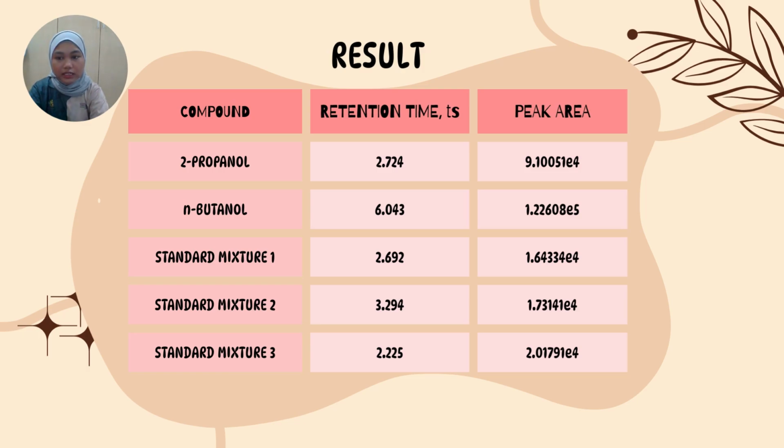More volatile or less polar compounds elute faster. Retention time is unique for each compound under fixed settings like temperature, flow rate, column type, and carrier gas. So consistent conditions are essential for accurate comparison. Lower boiling point compounds elute faster, while polar compounds may elute later if the stationary phase is also polar. Matching peaks to known standards allows reliable identification of compounds in the sample.